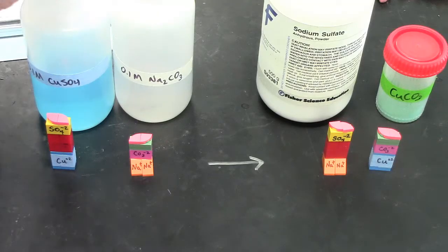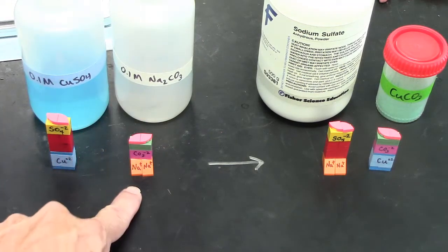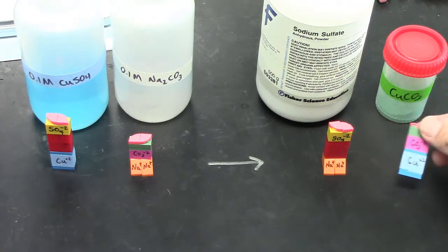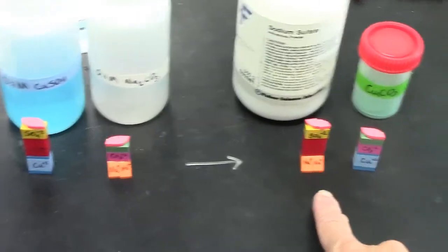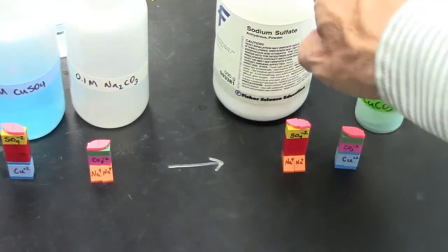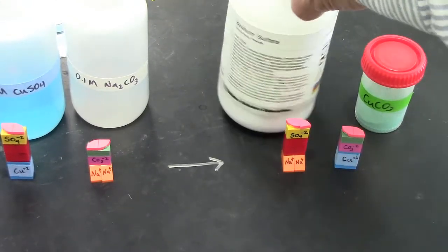You know from using your Lego models that what started as copper sulfate and sodium carbonate ends up as copper carbonate and sodium sulfate. Copper carbonate is this green salt here. Sodium sulfate is a colorless salt here, just white, boring.